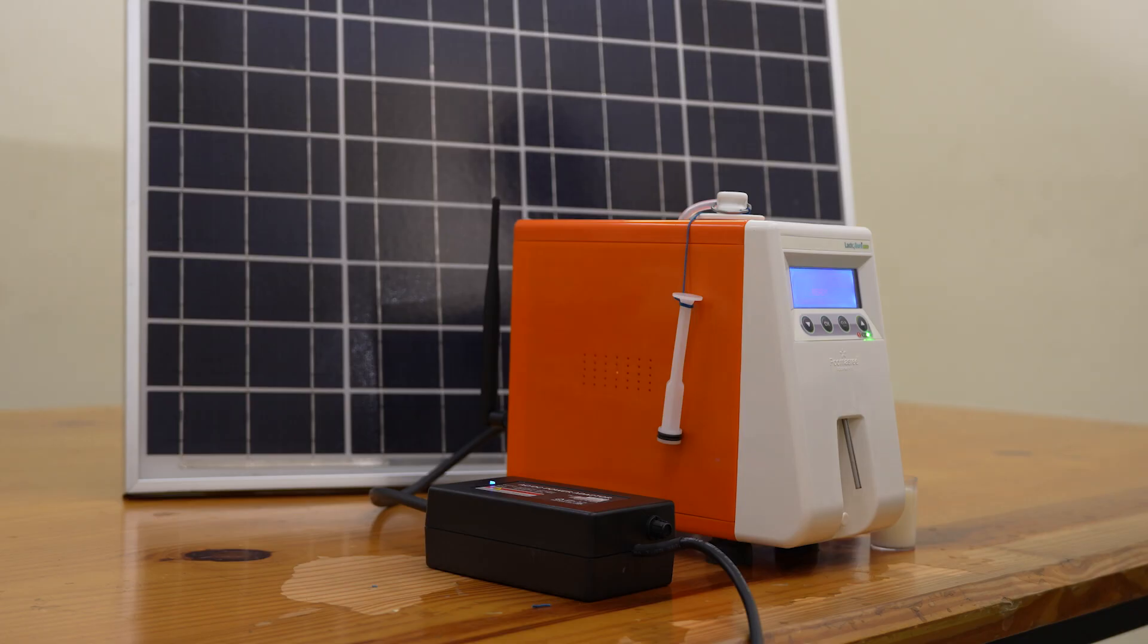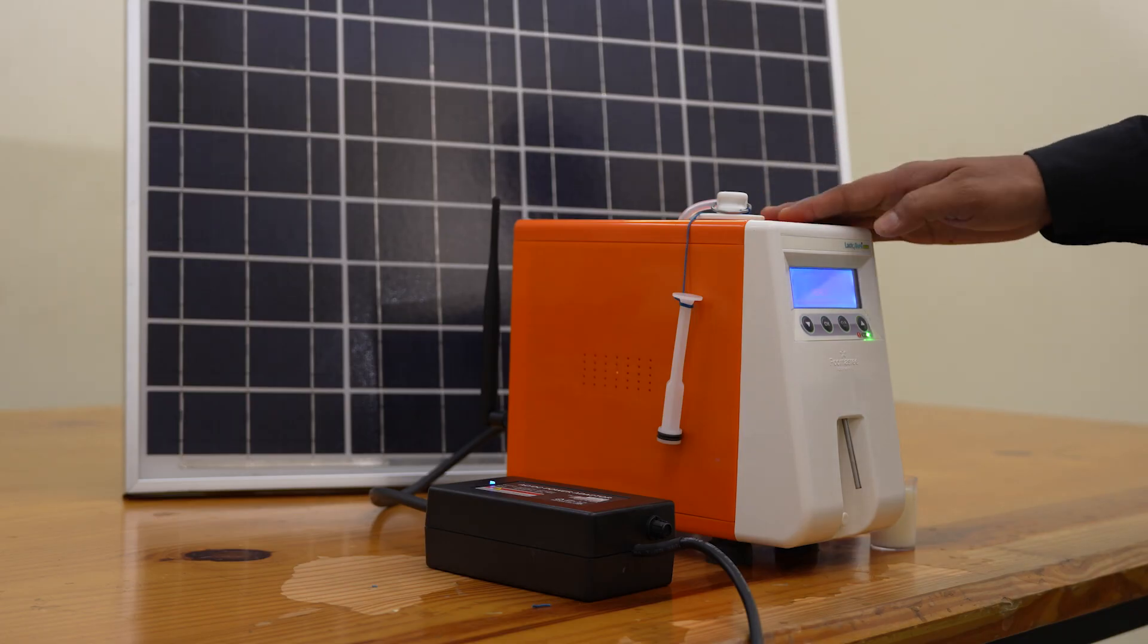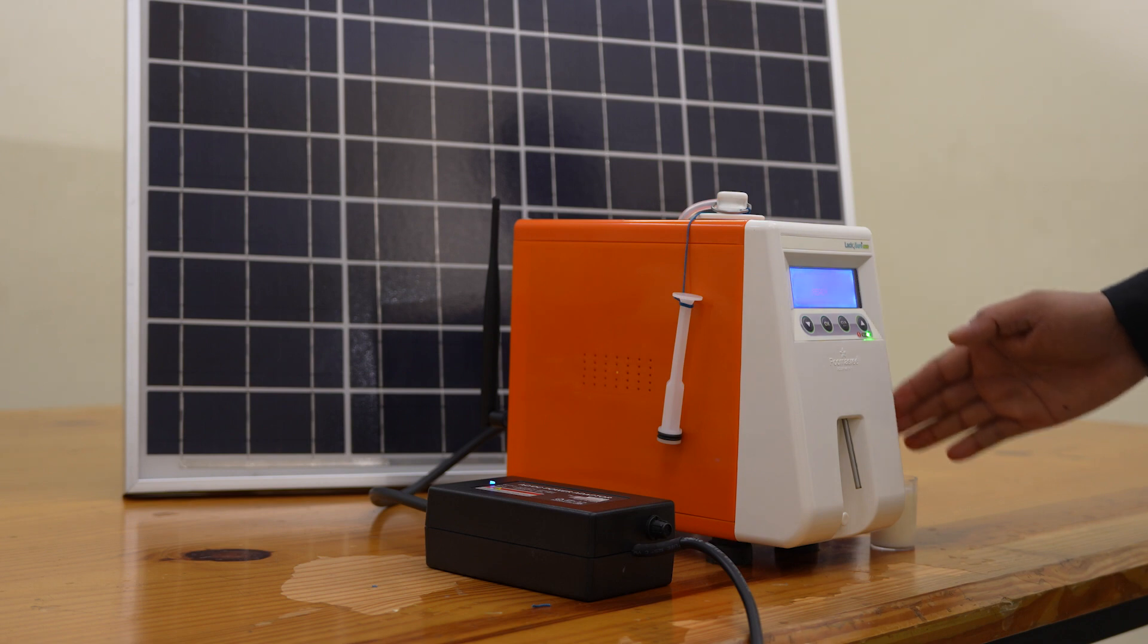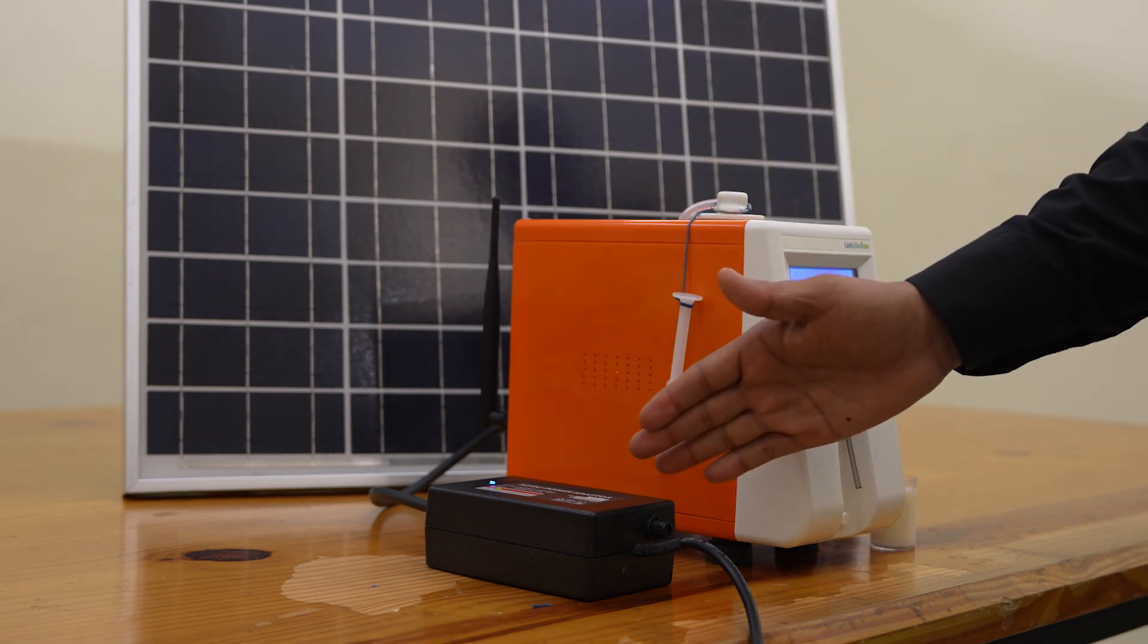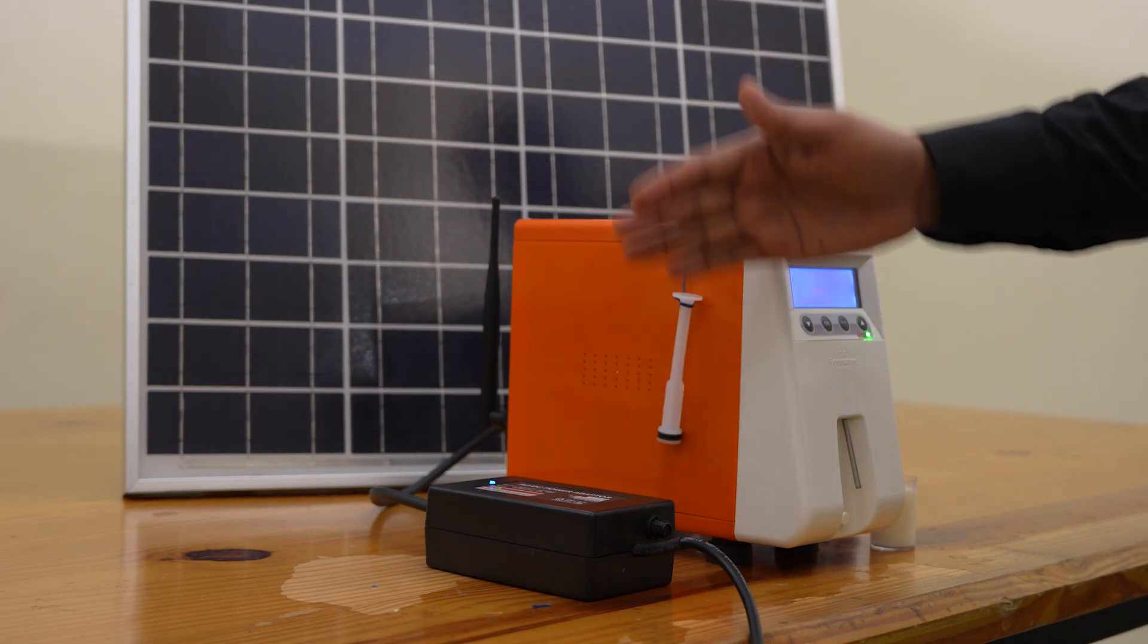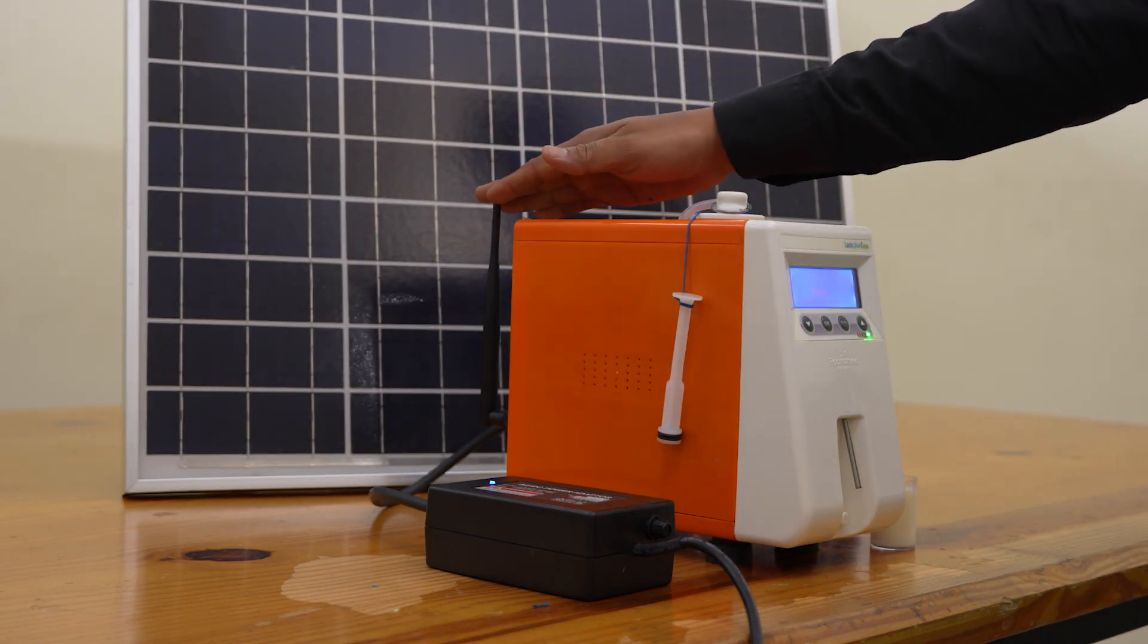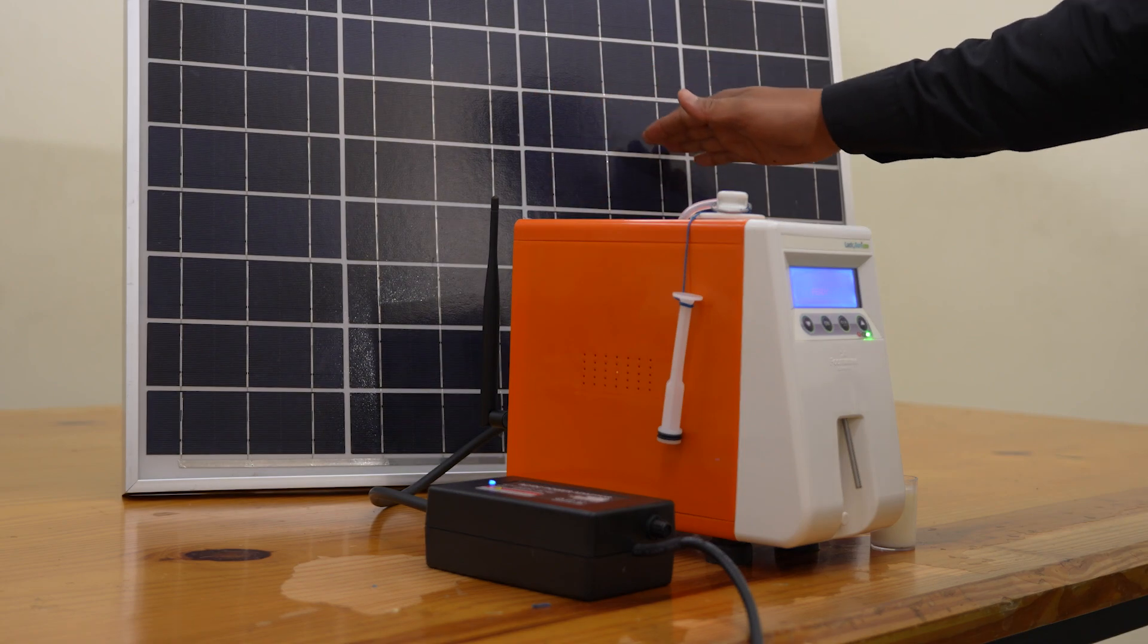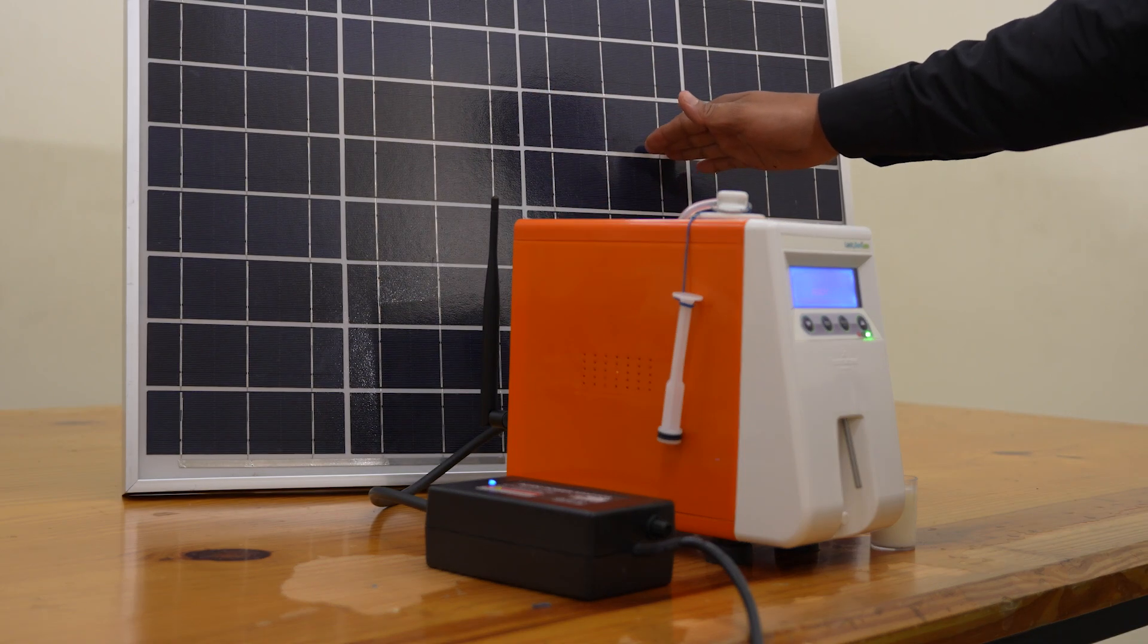Lactoshore equipment bundle has the analyzer, sample cup, charger adapter which is fully indigenously built, wifi section, and the solar panel.